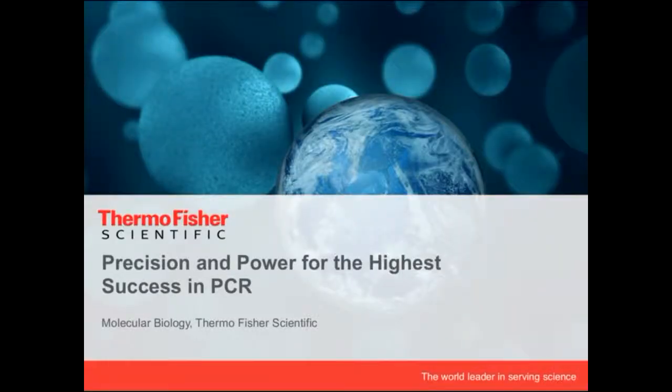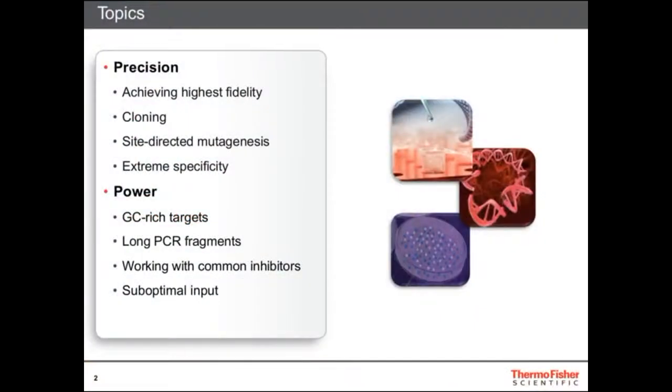So with the evolution of PCR, obviously we've been working very closely with our research and development team to create new enzymes for being able to address challenges that customers may face when doing these types of reactions. So the course of this discussion will first start talking about the work that we've done in the area of polymerases.